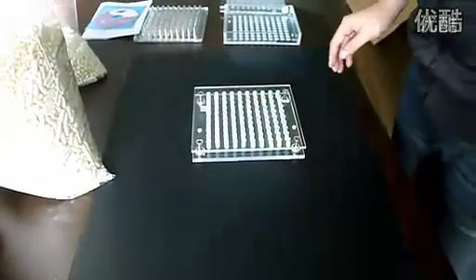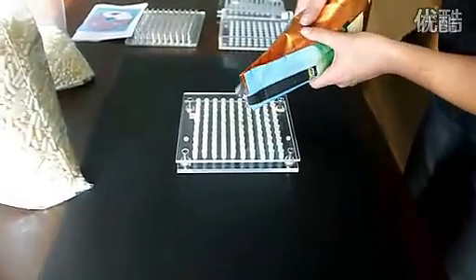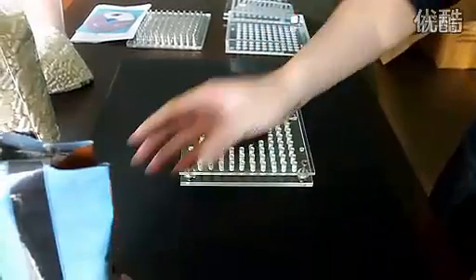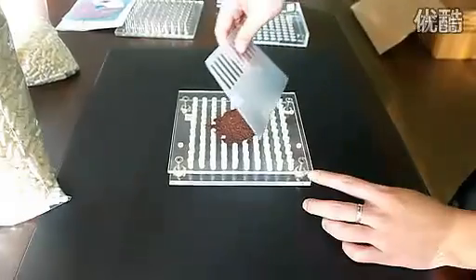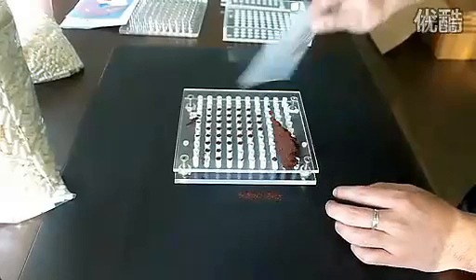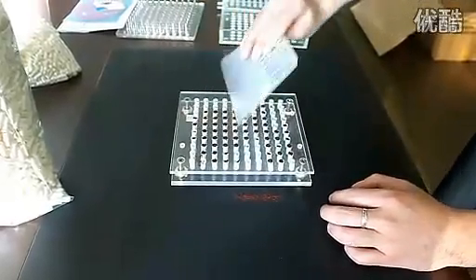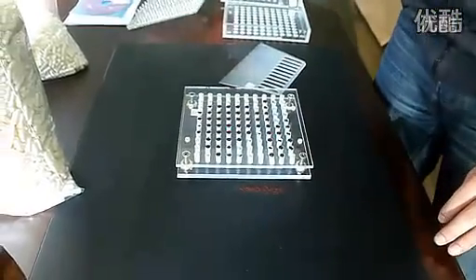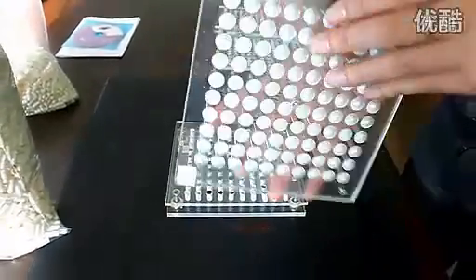Pour a scoop of powder filler onto the bottom sheet and use the spreader to fill the bottoms. If the bottoms are not filled enough, use the tamping tool to compress the fillings and repeat the previous procedure.